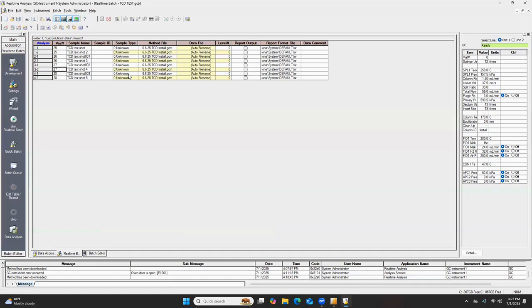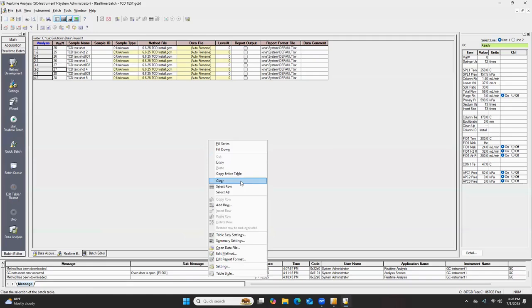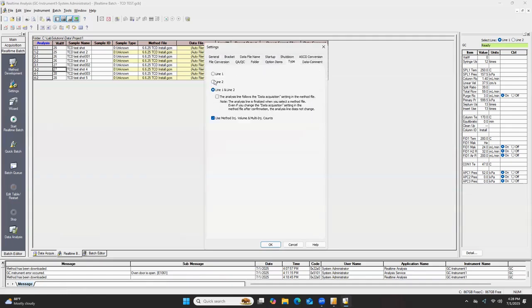So average 40 to 60 Celsius. That's why typically you won't run both analysis types at the same time. It's because those temperature settings are way, way different than each other. But still, if you guys are able to develop a method to where both of them get the same temperature, and the chromatograms are good, then by all means do it. But I just wanted to show you guys that. I'm going to go and turn that back off. Don't want it.